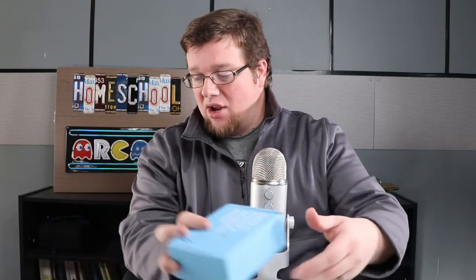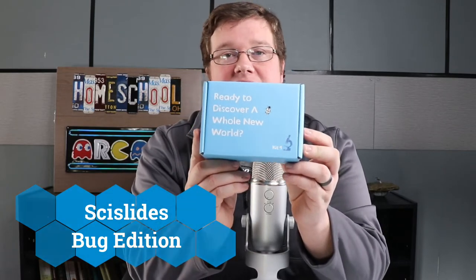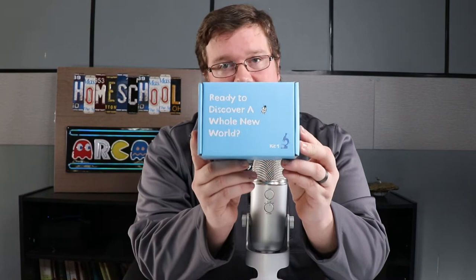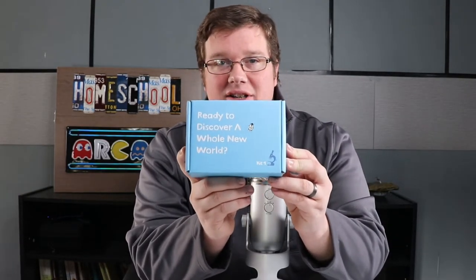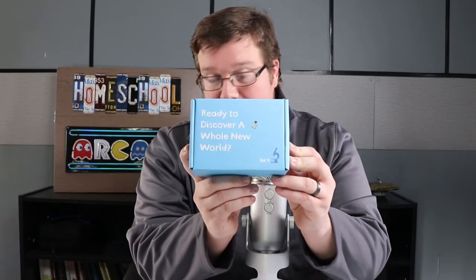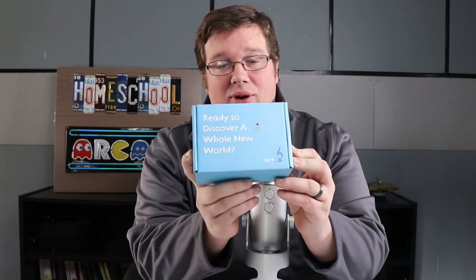Before we go on, let me show you the slide kit that we received. We received what is called the Bug Edition. These are sized slides and there are a few different ones — the Bug Edition which has a beetle inside for the kids to examine, the Zoo Edition which includes a snake skin, and the Tiny Animal Edition which lets you do a brine shrimp hatchery, which sounds really cool.